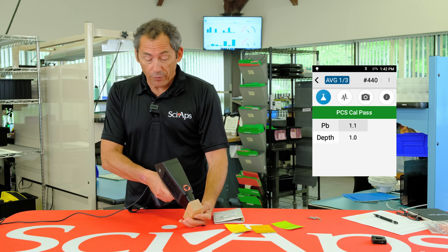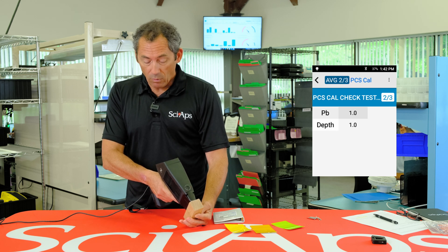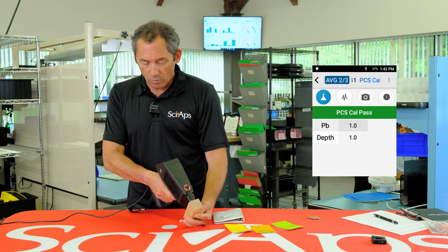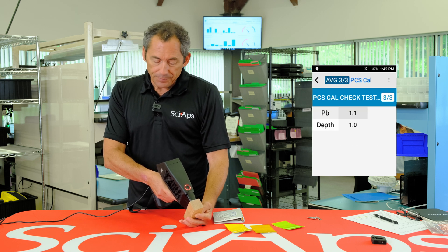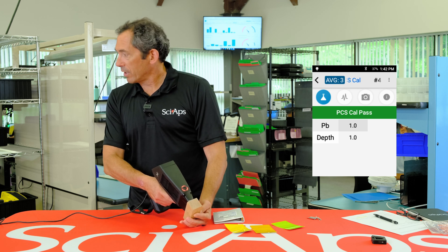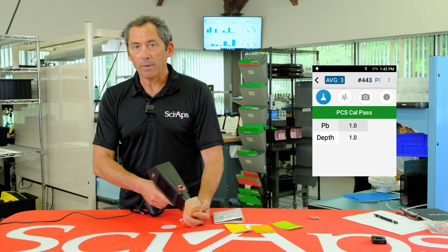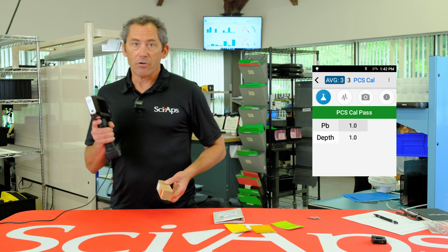It also said one of three. The PCS requires three consecutive 1.0 tests. There's the second one, and here's the third one. It says three of three, and now you're done. You've got your three tests and they've all been right at 1.0. The range is 0.8 to 1.2, so we're easily within range — that's a pass and you're ready to test.